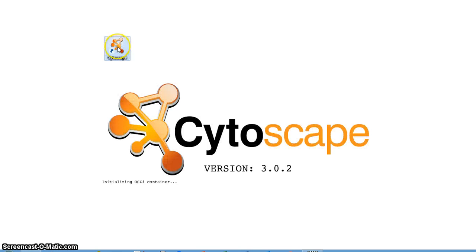So now we can open up Cytoscape. Cytoscape is a slow program. It will slow down your computer, so try to maybe have as few things open as possible when you're using Cytoscape.